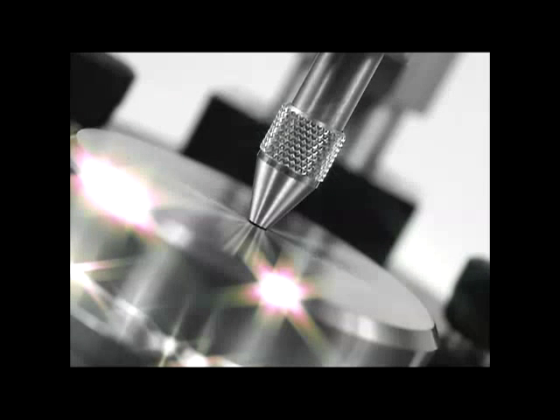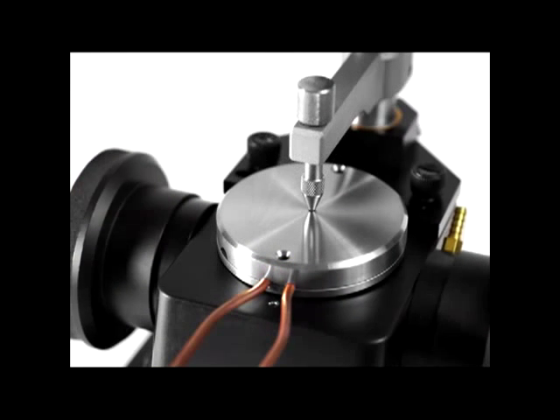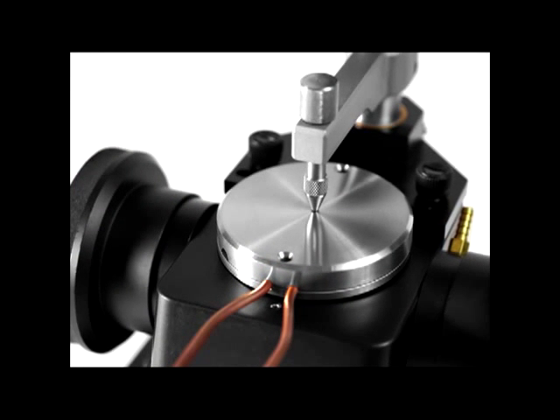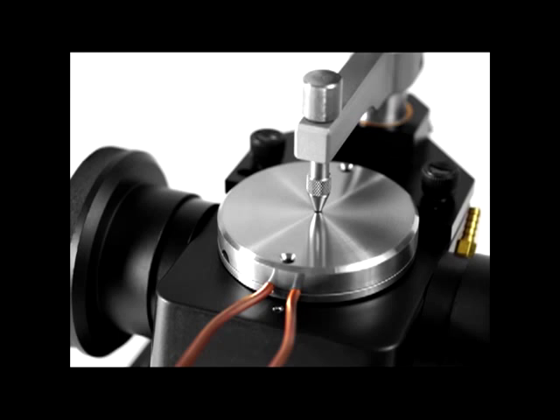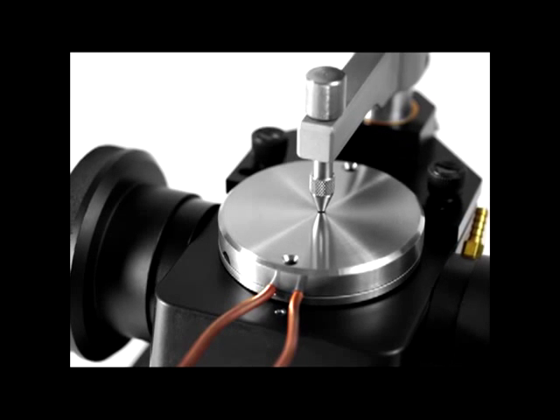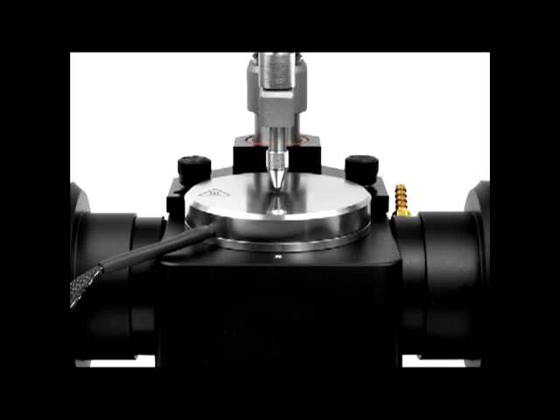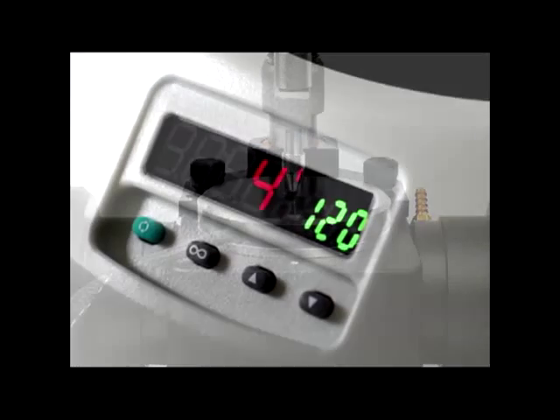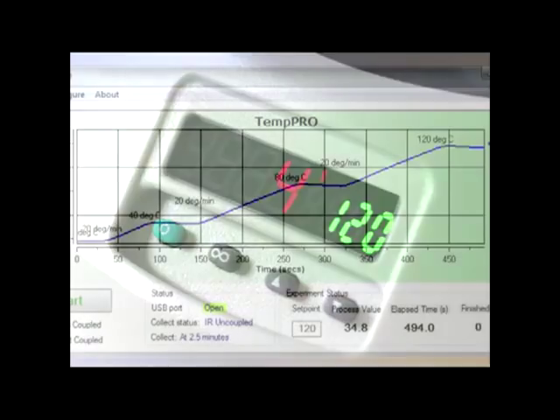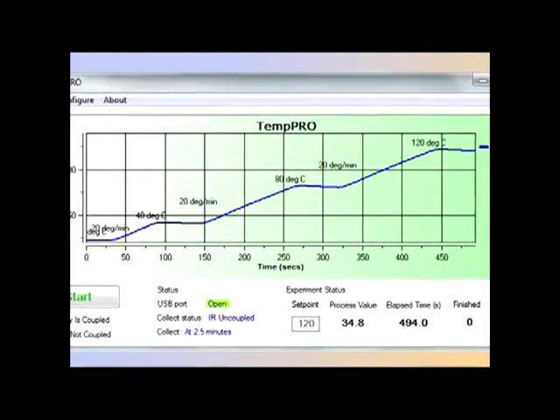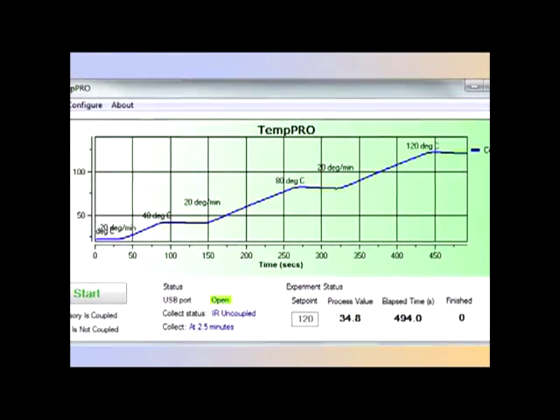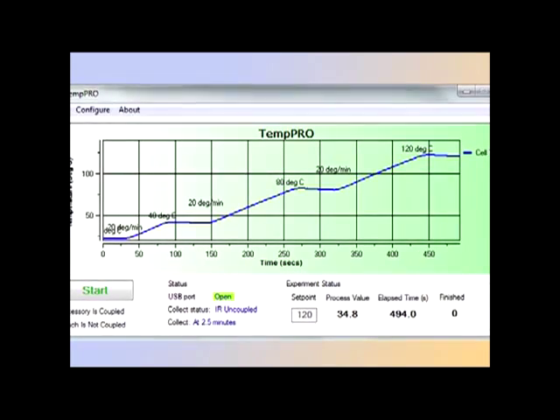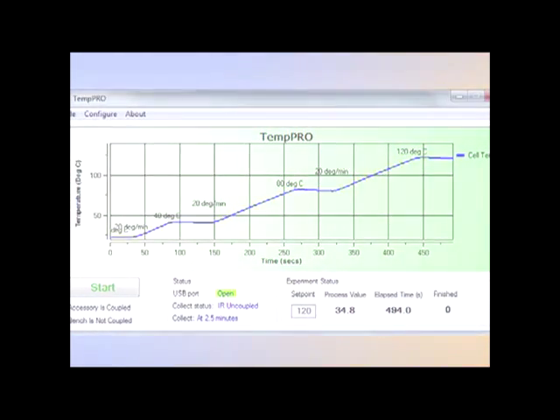For applications to monitor material transitions or to determine reaction kinetics, the MIRacle may be outfitted with temperature-controlled ATR crystal plates, like the resistively heated ATR plate and digital controller. Using Pike's TempPro software, temperature ramps may be programmed. TempPro interfaces with the software of most FTIR spectrometers for seamless data collection.